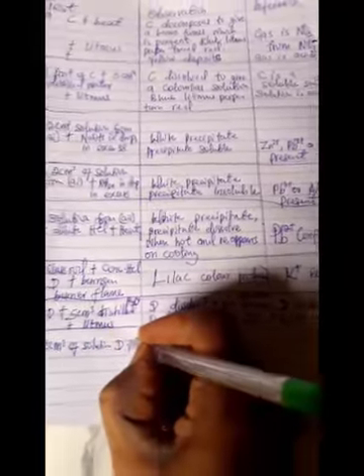So they will now say about 2 cm cube of solution D, which I did last time, plus what are we adding to it? Barium chloride. Plus barium chloride. What are we adding to it again? Plus HCl.